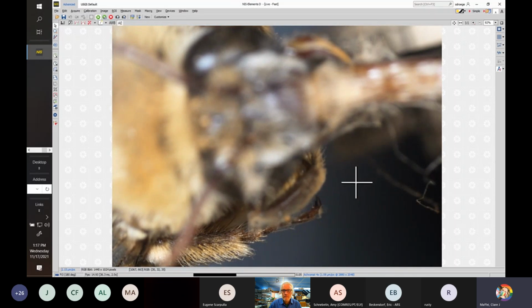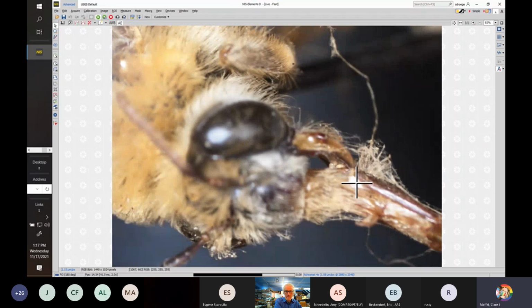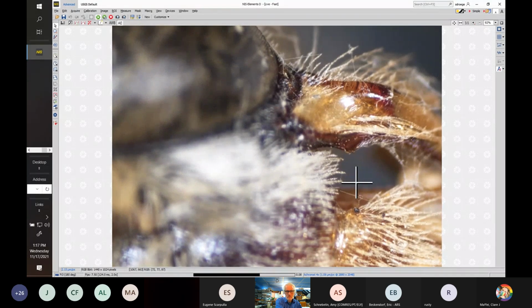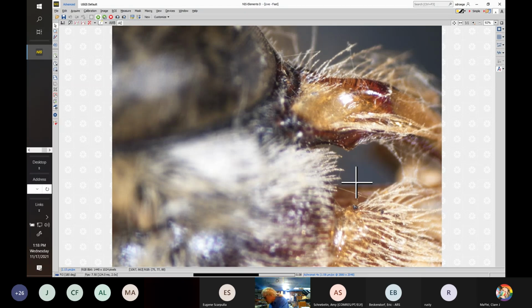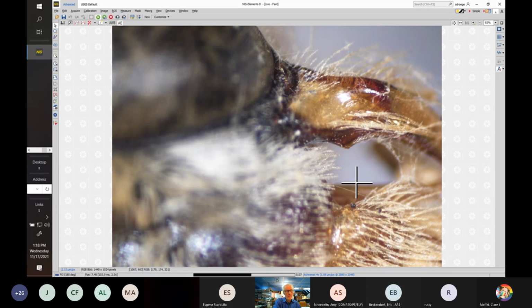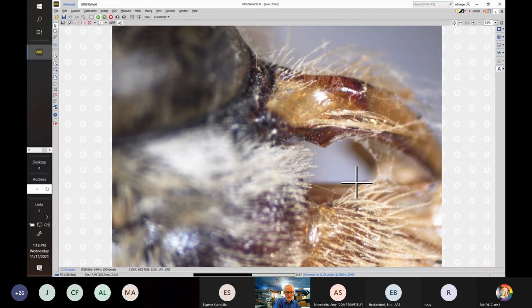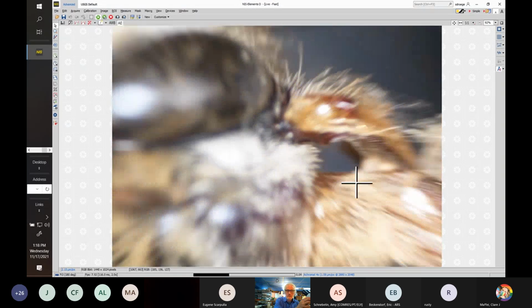Away, could I get a screenshot of that basal tooth? Oh, that tooth? Yes. Okay. I think we got some good backlighting there. Let me try and slide something white underneath there. I think I got a good one. Did you get one? How about that one? Oh, delightful. Okay, got it? Yes? Yes. Okay.